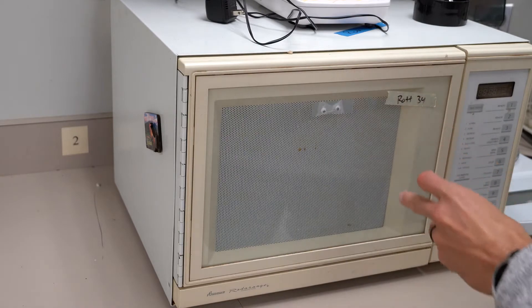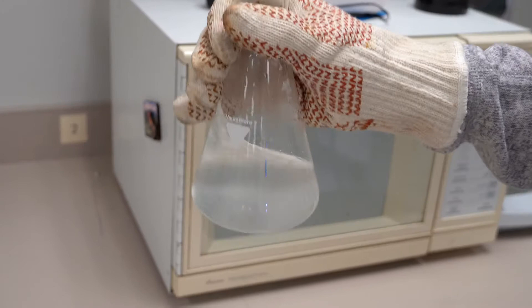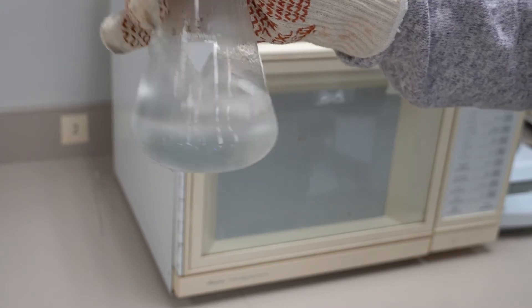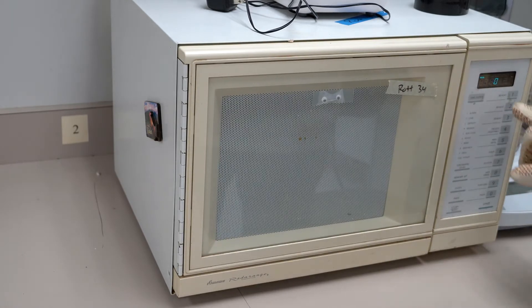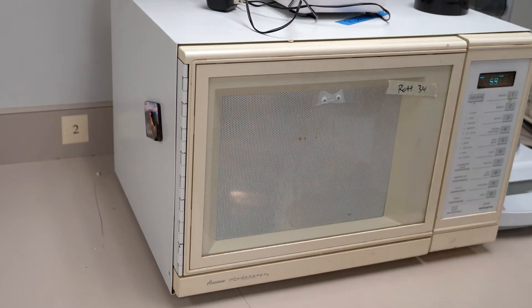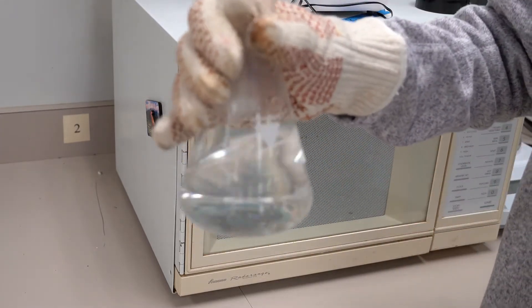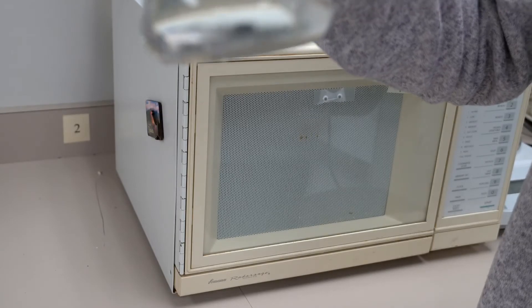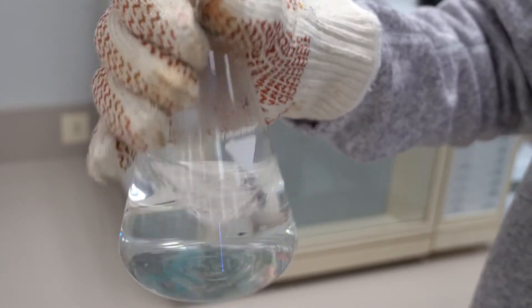Safety first — I'm using a glove because this is super hot. I'll give it a good swirl; we can see it's starting to dissolve. I'll put it back in for shorter intervals, about a minute at a time, so it doesn't boil over. Now it looks pretty clear, basically just like water, so I'll give it a few more seconds and then add our phenolphthalein.